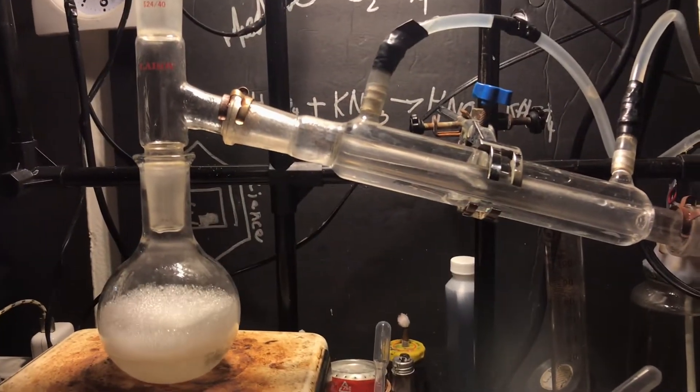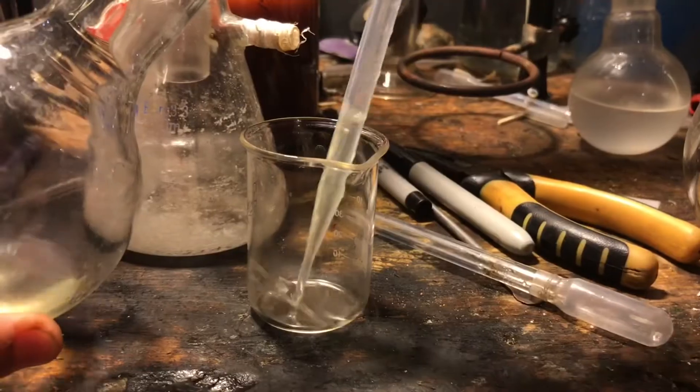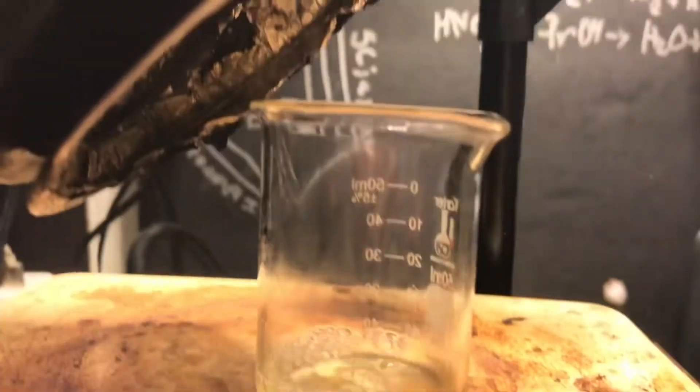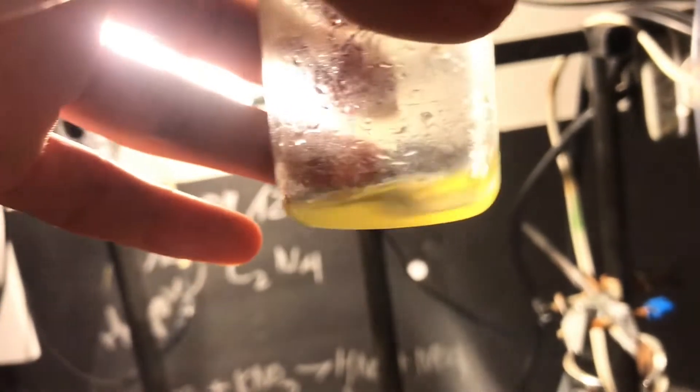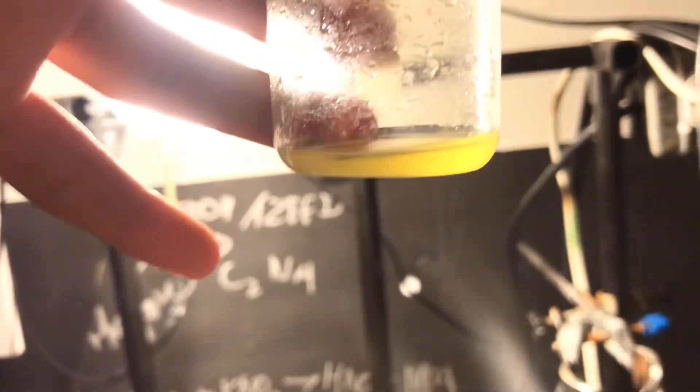Now distill off your solvent — you could just evaporate it too, but that's a waste of solvent. You can see it foamed up and we're left with a tiny bit, so I'll add it to a beaker and evaporate that off. I tried to dry it further by removing chloroform and water under vacuum, but that didn't really work well. Here's our yield of slightly wet cinnamaldehyde — around five milliliters or so. Not too bad, but we could definitely improve that.